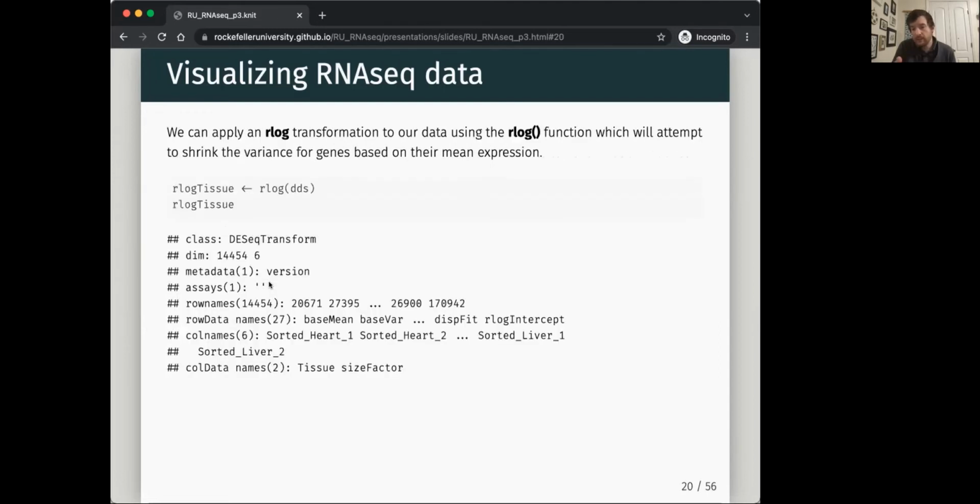And so one way to deal with this is to do an RLog transformation. This is essentially doing a log2, just like we just did, but it also does some variance stabilization of these low-end genes. It makes it a much more similar count value to the one that's actually going into your DESeq analysis. That's why we like using it for a lot of different approaches, because if you're going to be talking about DESeq, but then you also want to do some heat maps of the counts, using the RLog means it's basically using a very similar set of inputs.